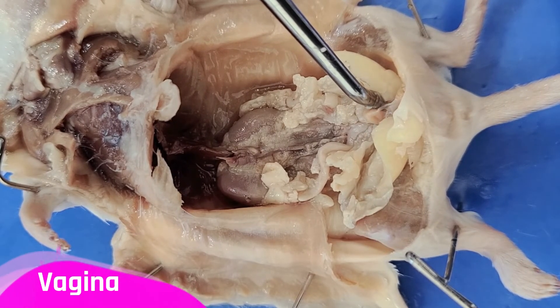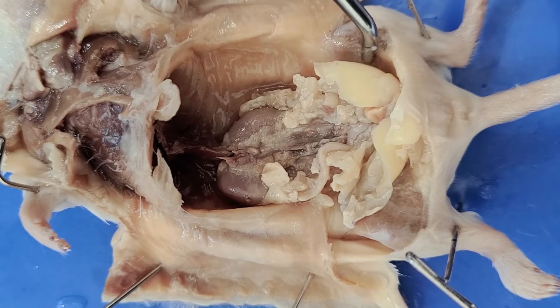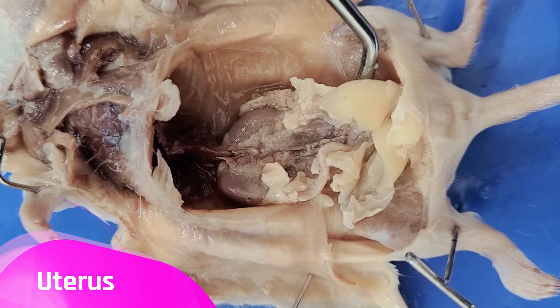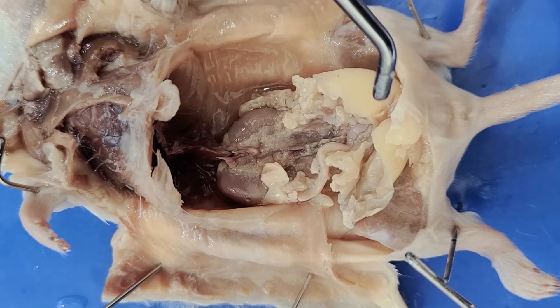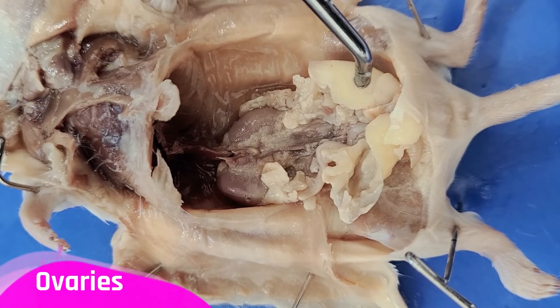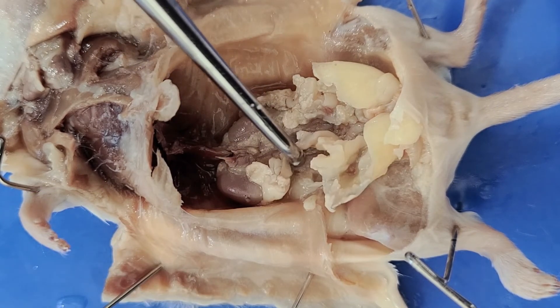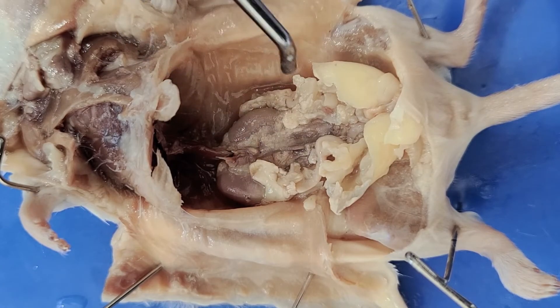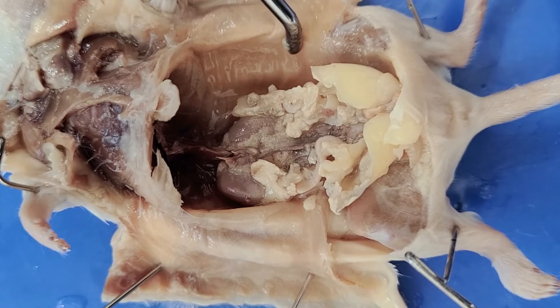Right next to the bladder is the vagina, and here's the uterus that leads up from it. The uterus is V-shaped, so there's one segment here and another one right here. The uterus leads up to the ovaries — here's one ovary, and here's another ovary on the other side. This is a female mouse, so that's why we see female reproductive organs. A male mouse would have male reproductive organs.